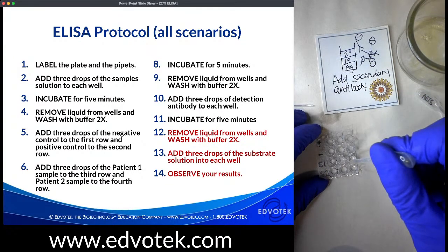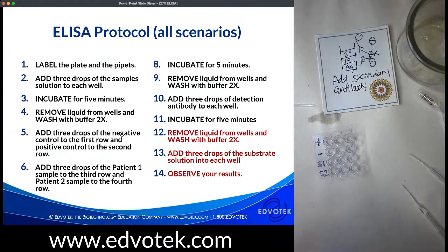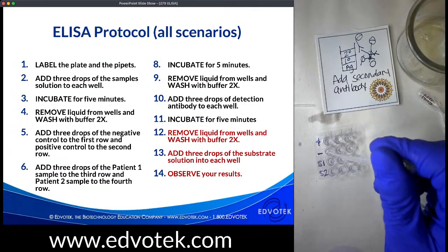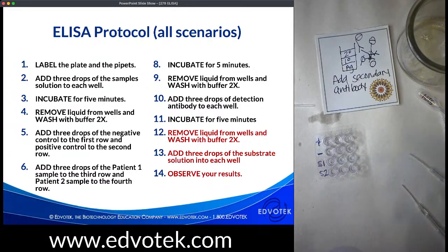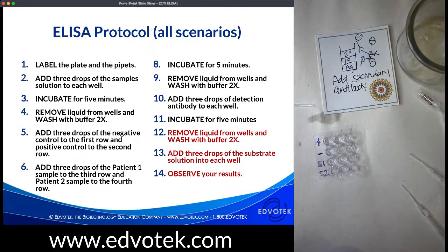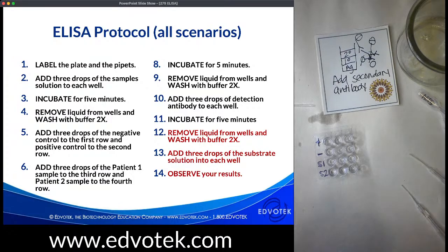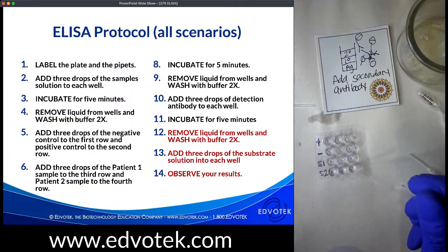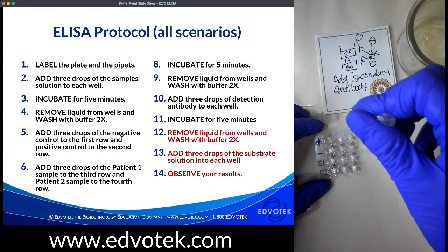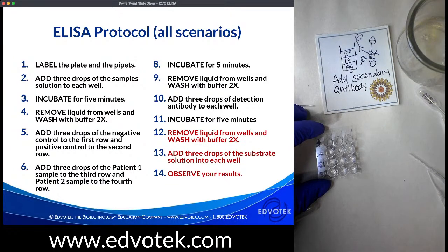The ELISA is very simple, very powerful. Probably if I wasn't talking so much, we would have been able to do it even faster. Usually I feel like you can do this assay in about 40 minutes if everything is set up right. The biggest time is the incubation times, in that we have to wait for all of our complexes to form. But even that said, to be able to do an experiment like this in a class period, I think it's a really powerful thing for students to be able to do.